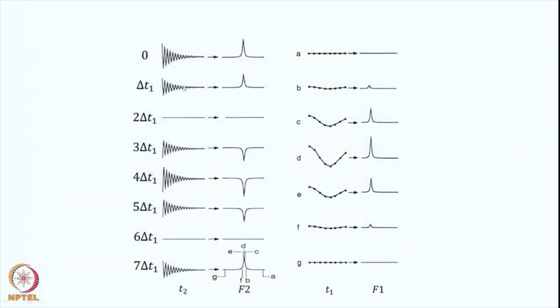In each of these periods, of course, you follow the same rules as in Fourier transform NMR. If you want to do signal averaging, for each time increment here you must do the signal averaging, 8 scans, 16 scans, whatever you have to do for each of these experiments, and you collect a 2-dimensional data set. Okay. Now let us see what happens afterwards. So here is an actual demonstration.